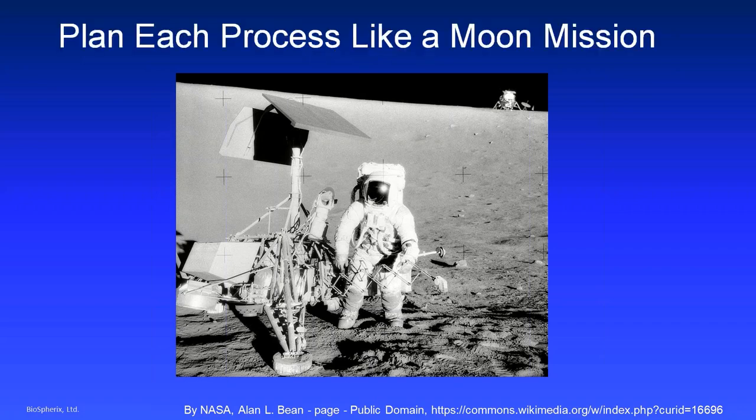Now, we like to plan each process in the Xvivo system like a trip to the moon, like a moon mission, because it's super frustrating to be in the middle of your process and need one more thing. You have to take your hands out of the sleeves, you have to get up out of the chair, go find that thing, disinfect it, let it dry, get it into the Xvivo system through the log dilution ventilation.